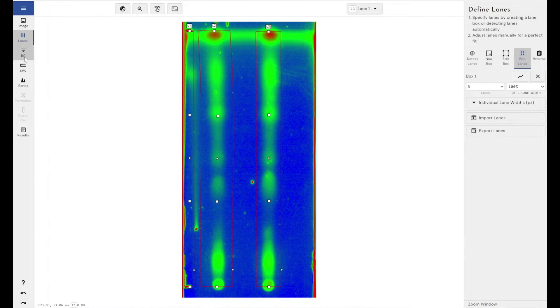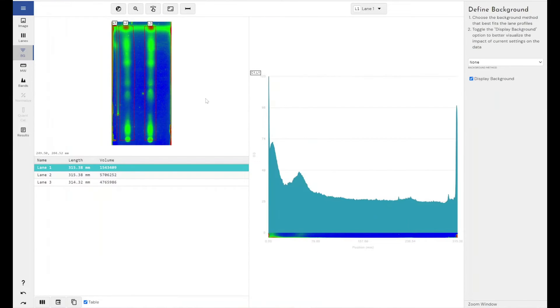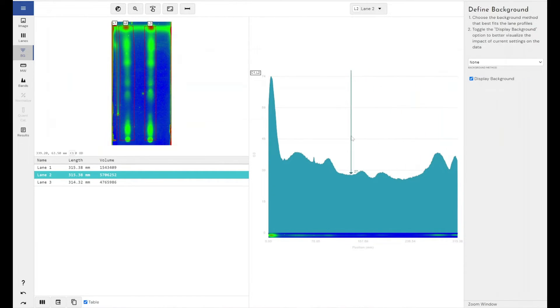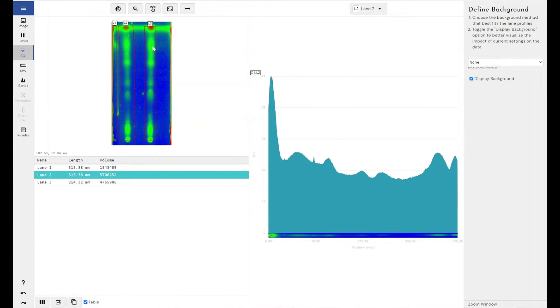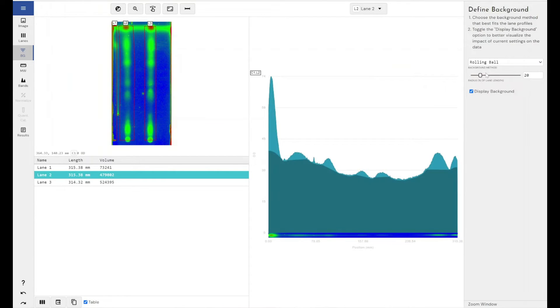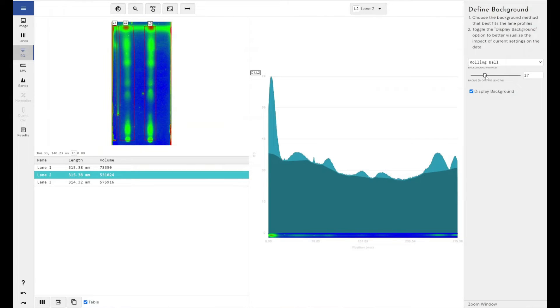So let's move on to the background removal step now. Background removal. Click on lane two. So here you can see there's the profile of our lane. So these peaks are essentially our spots. And because this is a TLC image, it does have quite high background in that this is all continuous sample in different fractions. But there's not really space for background in between the samples. So I'm going to use the rolling ball subtraction method that we've got built into Phoretix, because this is an algorithm that deals really well with changing background across the length of a lane.